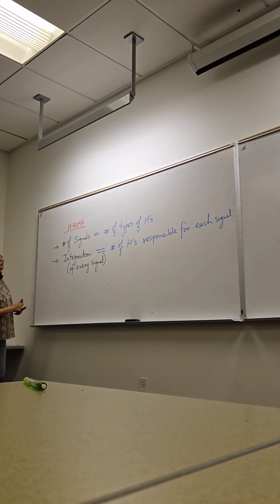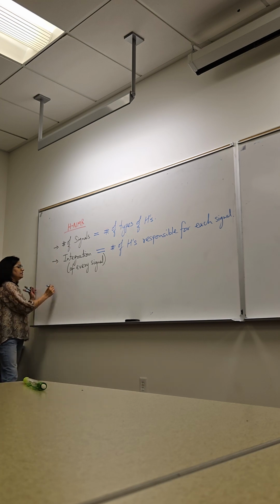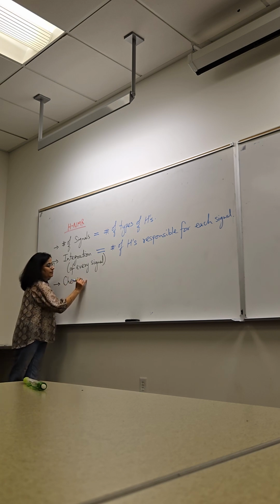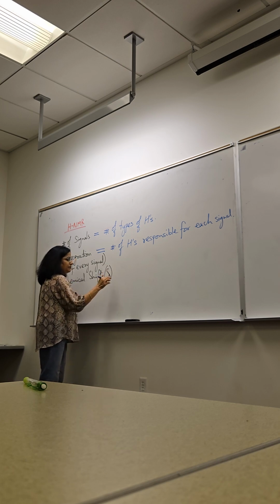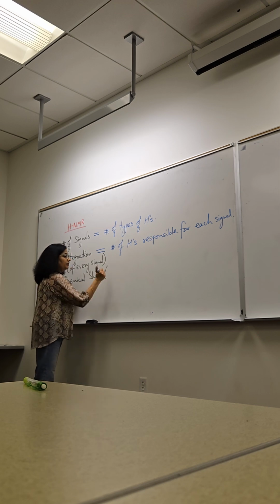The third thing I look for, actually, I'm going to write it as third, but that's probably the last thing I look for. Something called chemical shift. The symbol for chemical shift is lowercase delta. Let me write that again, didn't do a very good job.